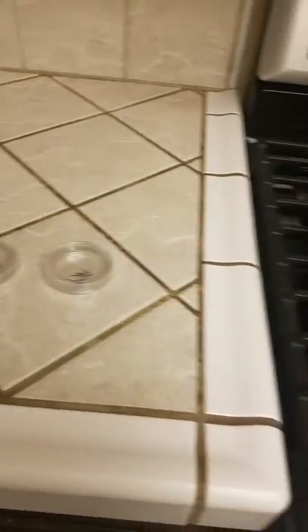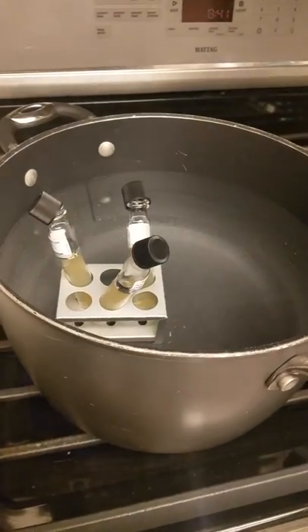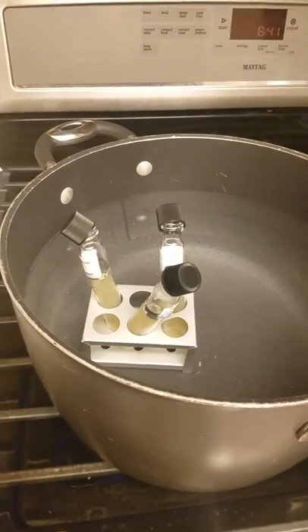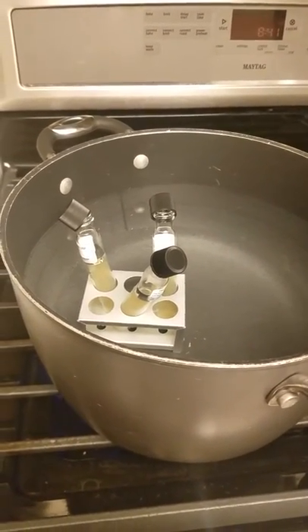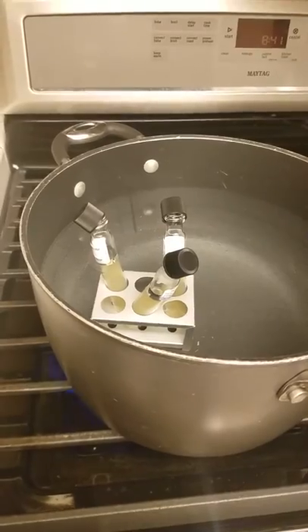I'm here in my kitchen and I have my petri dishes that I am getting ready to plate my agar in. They will be boiling here shortly, hopefully, and we will continue after that.